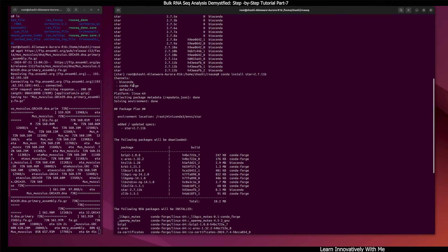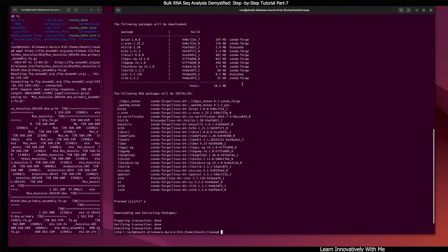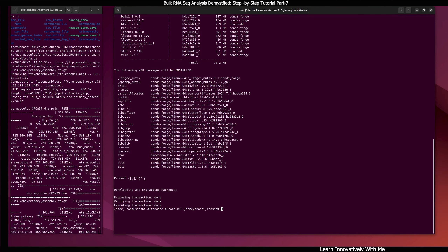It is very important to note that in my current conda environment, conda-forge and defaults channels are already added. But if you are using conda for the first time, bioconda and conda-forge may not be available. You'll need to configure those channels so you can get the STAR package, since it is available via the bioconda and conda-forge channels. I have already discussed this in the first part of the tutorial series — you can get the information from there.